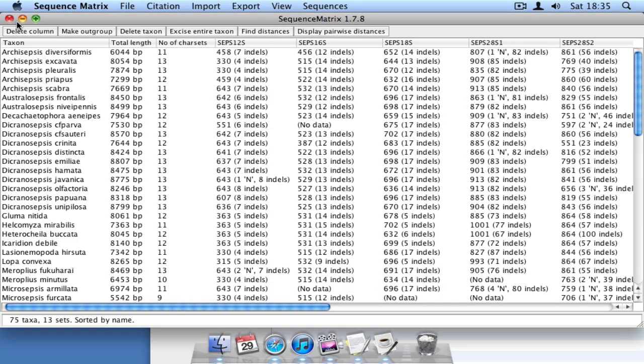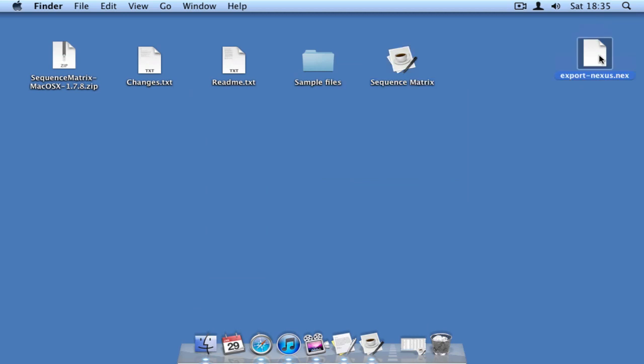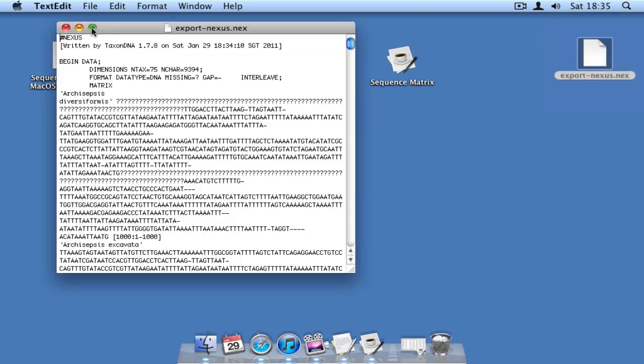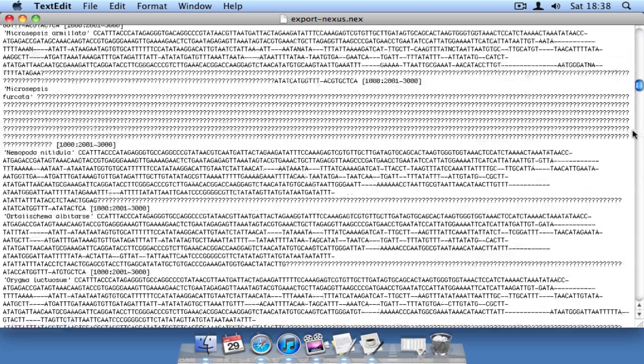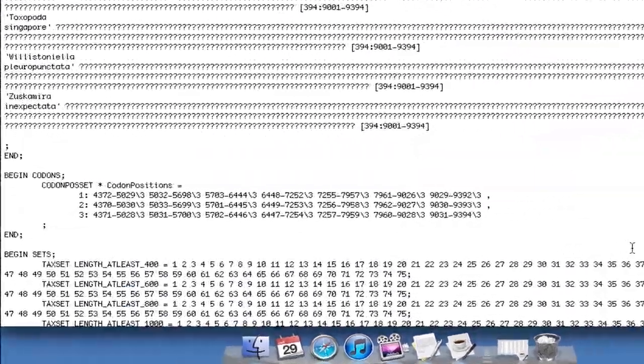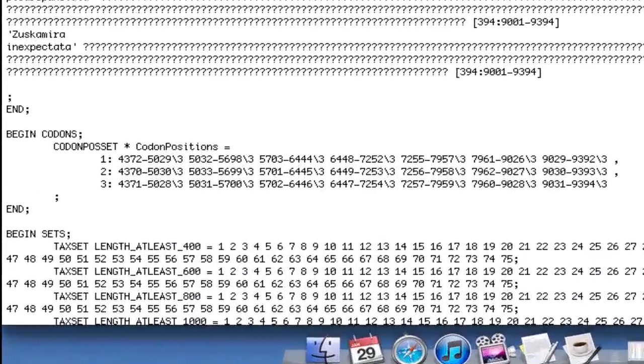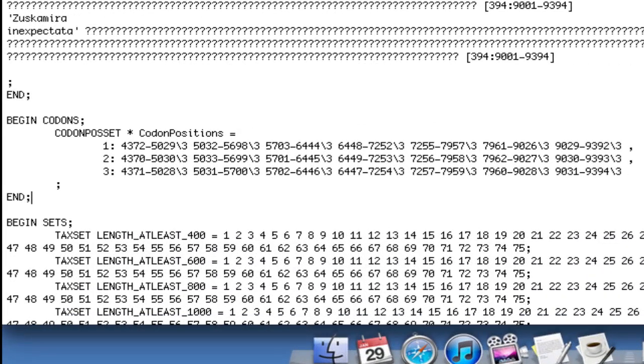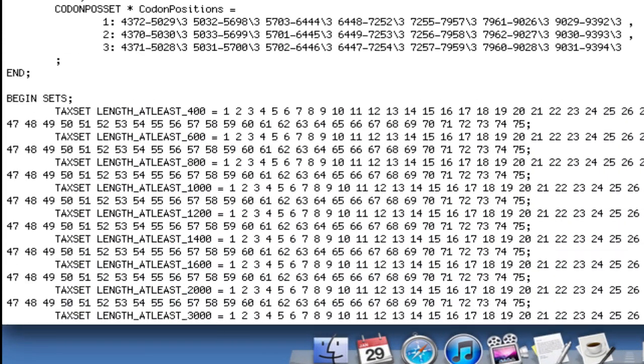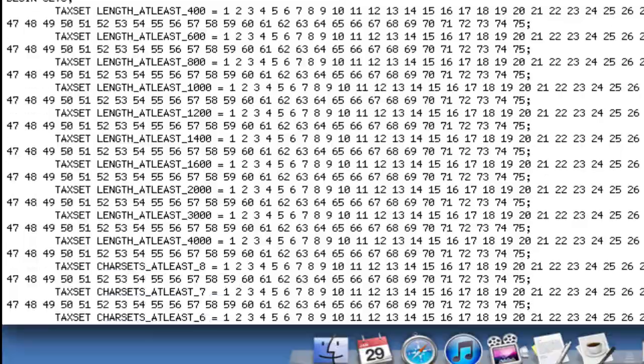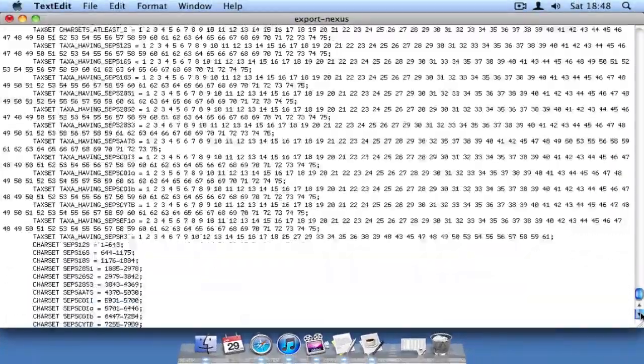Now if we open up that file and scroll to the bottom, we can see that codon positional information was preserved. We notice some tax sets, which will be explained in another video, and finally the character set information.